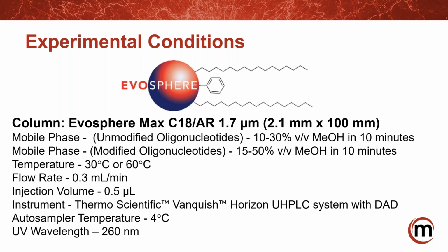We knew the goal was, hey, we see that you've done this type of work. In the paper we talk about this pi-pi stacking mechanism that they believe is happening on the single-stranded oligos. So our initial study was, well, if that's the case, you might want to look at our different phenyl-based chemistries. So we gave them the phenyl hexyl, the C18AR, and the diphenyl, and they ran all the same separations that I showed on those as well.